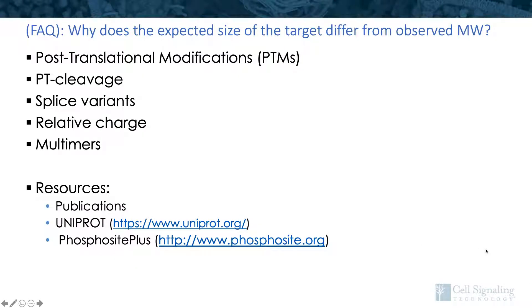Going back to the target size question, the expected molecular weight is based on amino acid sequence listed in UniProt or other sources, and this may not be accurate because it doesn't account for how the protein migrates on the gel. The listed amino acid sequence also does not account for post-translational modifications or PTMs — enzymatic modifications of proteins following biosynthesis, including phosphorylation, acetylation, and glycosylation. Post-translational cleavage can occur, as some proteins are synthesized as pro-proteins then cleaved to make the active form. Alternative splicing and isoforms could create different-sized proteins from the same gene. Relative charge, composition of charged versus uncharged amino acids, and potential for multimers such as dimerization also affect migration.